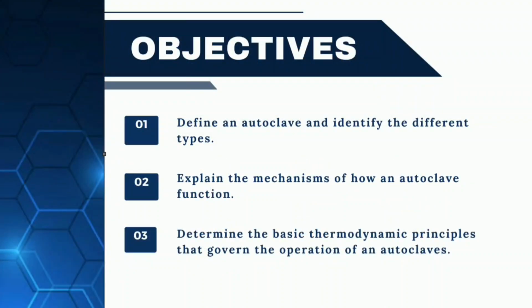First is to define an autoclave and identify the different types. Second is to explain the mechanisms of how an autoclave functions. Third is to determine the basic thermodynamic principles that govern the operation of an autoclave.